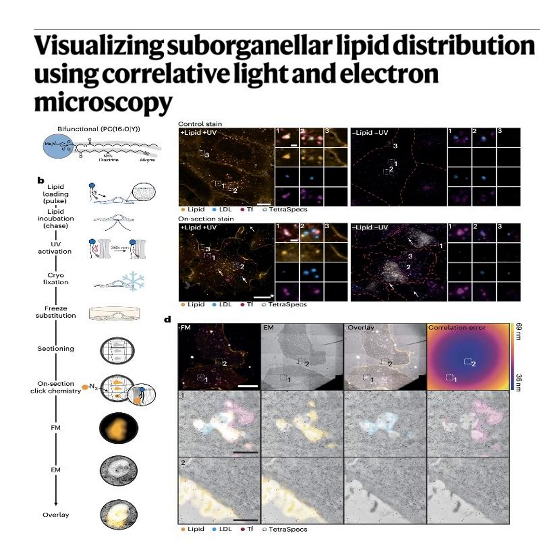They built a custom 365 nanometer UV LED device. Plus or minus 10 nanometers, right. Exactly. But instead of shining it from below, they placed it directly into the aqueous medium above the sample. Oh, that's smart. Yeah, top-down illumination through the liquid using a spacer ring to guarantee homogeneous light distribution. It bypassed the carbon shadow entirely. With that rig, a 3-second UV pulse was all it took. 3 seconds. That is brilliant engineering.